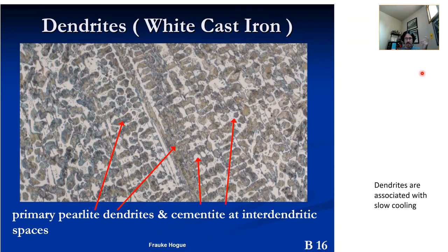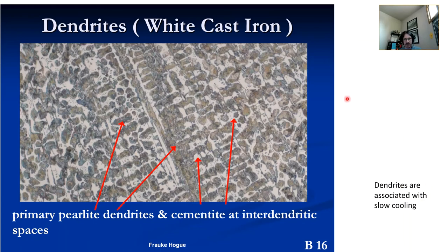We typically associate dendrites or a dendritic microstructure with casting. This is white cast iron — pearlite dendrites with cementite in the interdendritic spaces, giving a lamellar structure and cementite in the interlamellar structure. We associate dendrites with slow cooling because we see dendrites in other manufacturing processes besides casting — namely additive manufacturing. So dendrites can appear in other material systems and processing techniques.